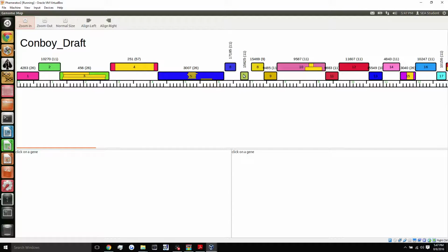As you can see, there aren't phams or little yellow boxes for each gene. These are empty. 6, 7, 8, 9. That simply means that there isn't really a pham or any functions that they can list to those genes quite yet. But as we discover more about phages and their proteins functions, you can expect maybe these to be filled in a couple of years. So 1, 2 is empty as well.